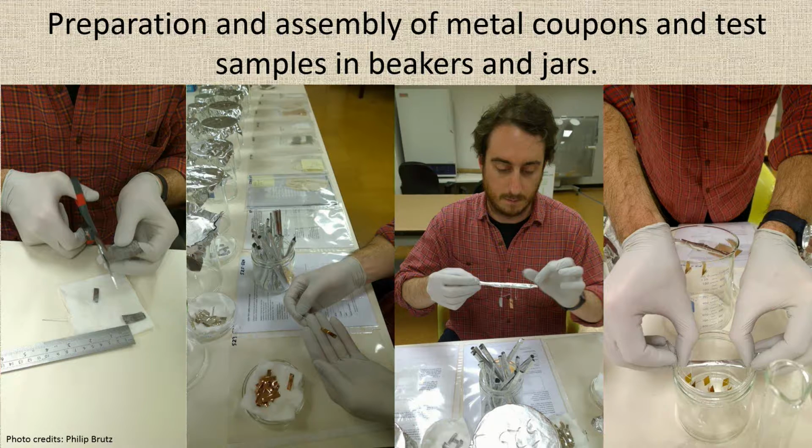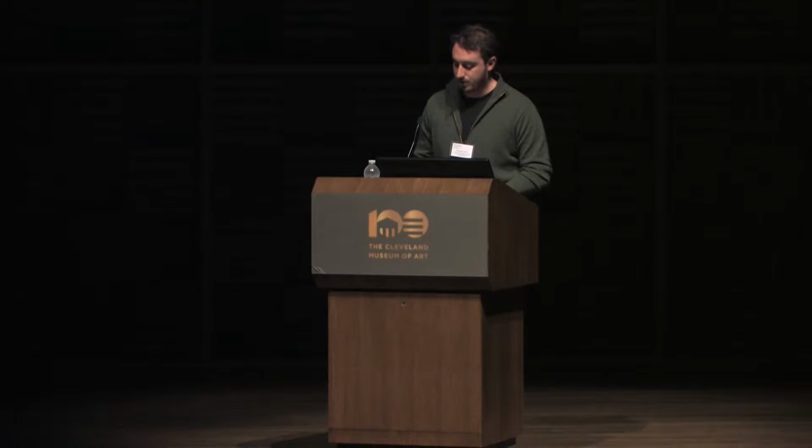I dry the metal with cotton pads, and using a microscope, I very carefully examine all of the surfaces of the metal for any remaining traces of corrosion. If I see any corrosion at all, I repeat the polishing process with 1 micron alumina. Next, I use 0.3 micron alumina to bring the surface of the metal to a mirror-like finish, and again clean polish residue from the metal using the ultrasonic cleaner with deionized water. Finally, I degrease the copper and silver coupons, again with naphtha, ethanol, and acetone. To remove surface corrosion from the lead coupon, I use a fine grit sandpaper, then degrease the metal with naphtha, ethanol, and xylene.